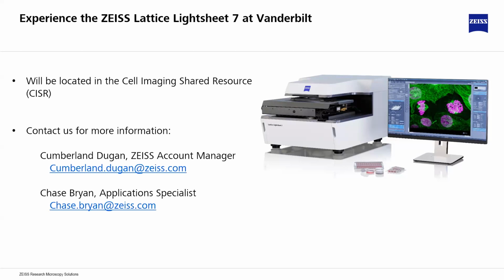You need to go to 92. Yeah, I believe the back-thinned would be 92. Anecdotally, the back-thinned has a higher noise floor. So I think this actually does give the better image quality, not being back-thinned, but sacrificing a little on the QE side of things. Better dynamic range, yes, I believe so.